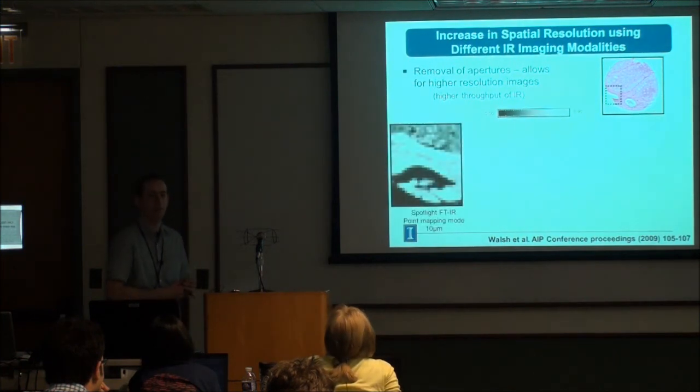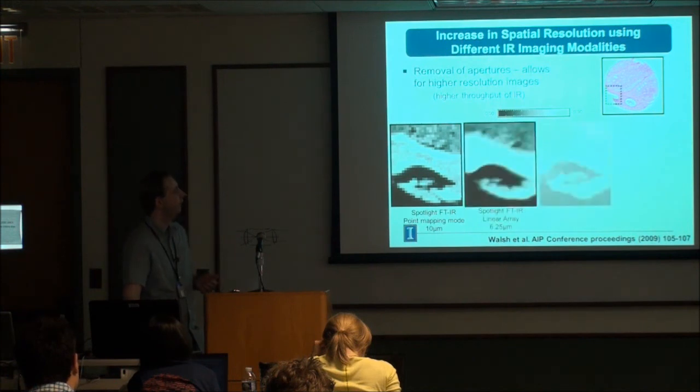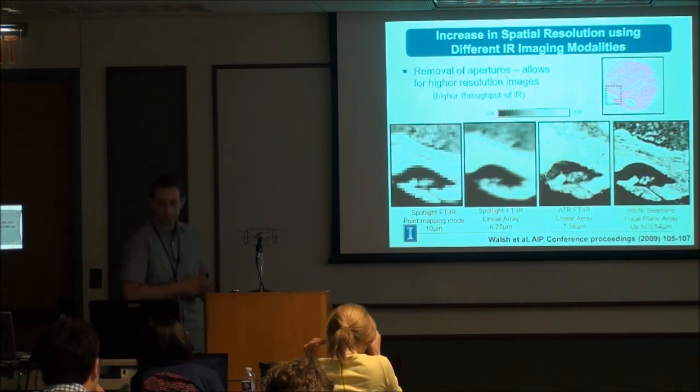Just to give you a timeline of the spatial improvements, this is what I was doing for my PhD on stem cell crypts and cervical smears. With advances in detectors, we've been able to improve this slightly, and this is now the type of resolution that we can get using a 74x coupled with a synchrotron.